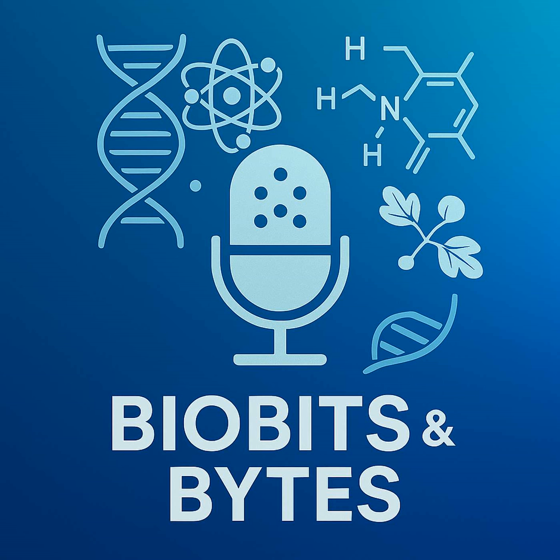Okay, let's try and wrap this up. We've covered a lot of ground. Blotting techniques: Southern for DNA, Northern for RNA, Western for proteins. And ELISA, this versatile plate-based assay. They all give us these incredibly powerful ways to investigate the molecules driving life itself. From finding one specific gene sequence to measuring tiny amounts of protein, these are core methods.